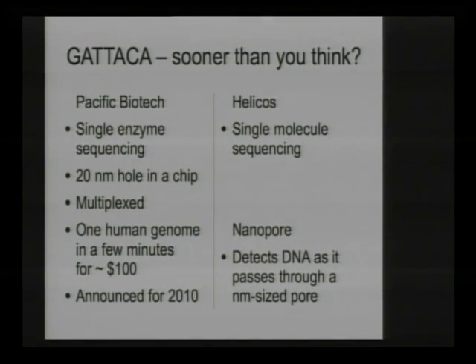And you have Nanopore, they do something similar to Pacific Biotech.